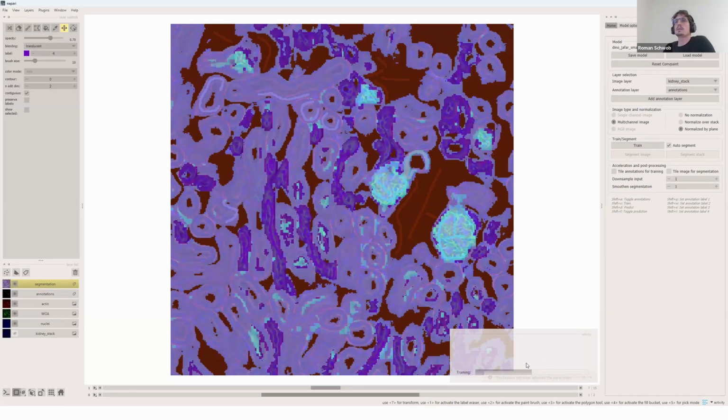And this is something else that we're definitely planning to implement very soon: some more interactivity while it's computing. So a bit more information about where exactly in training it is, and giving the option to abort. We see that this would be really helpful as well.